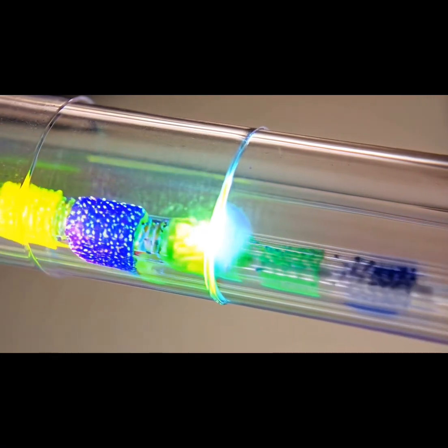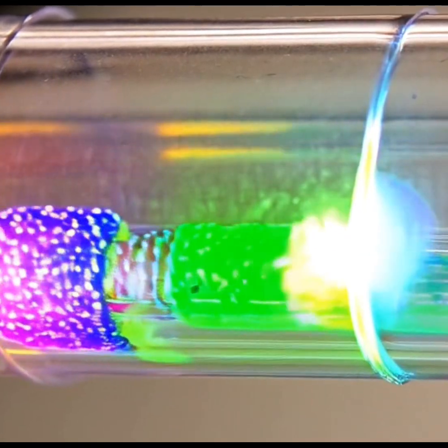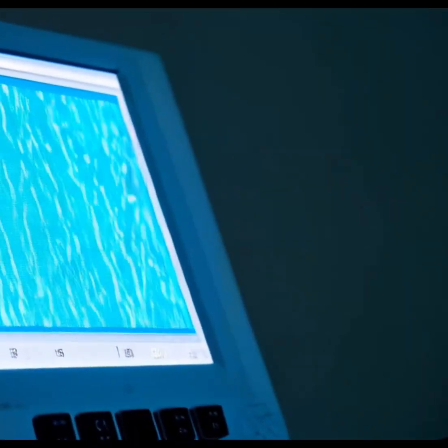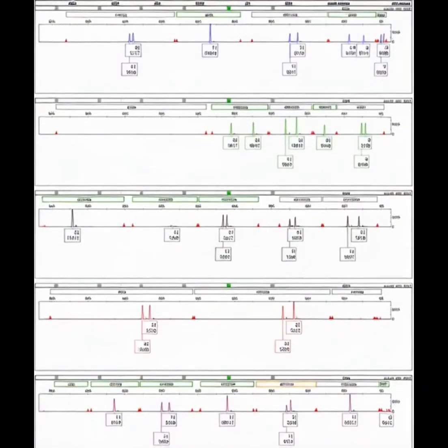At the detector, a laser excites the fluorescent dyes on each STR fragment, causing them to fluoresce. This allows fragments of the same size to be distinguished based on their dye color. After data collection, an electropherogram, EPG, is generated by automated genotyping software. As alleles are separated and called, the EPG, also known as a DNA profile, is created. This profile can then be uploaded to databases or compared to suspect samples.